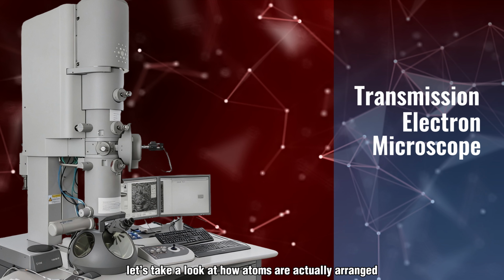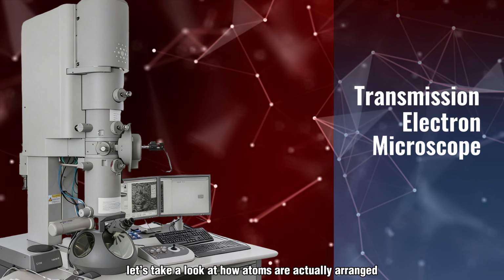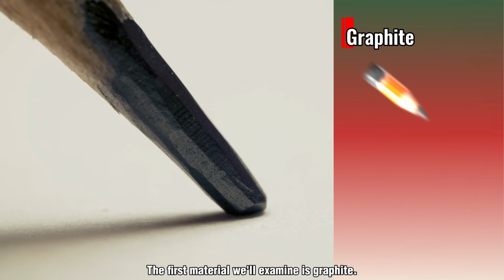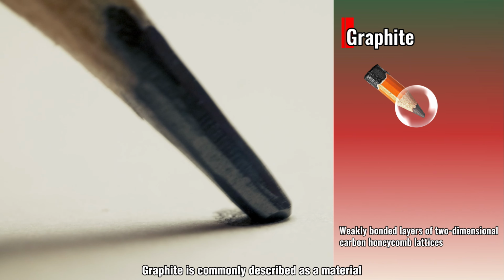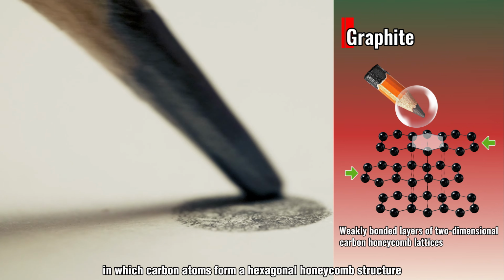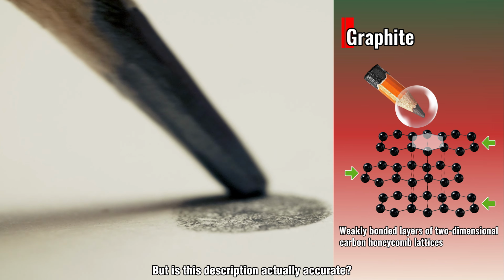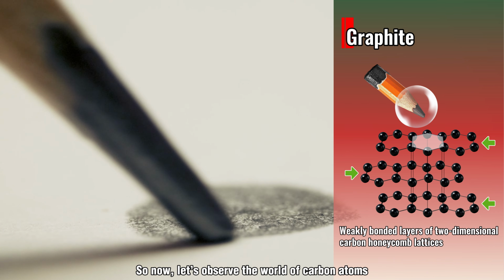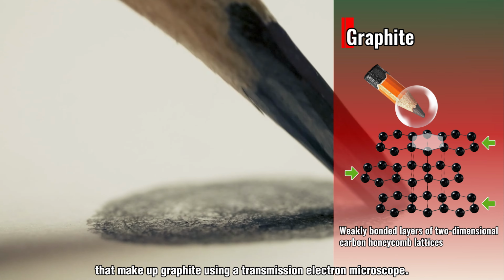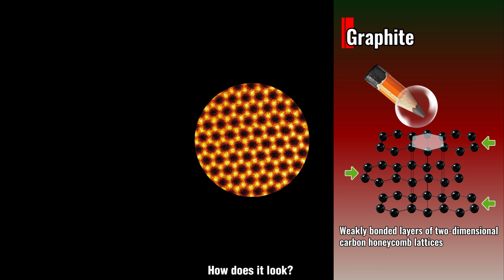So now, let's take a look at how atoms are actually arranged inside real materials using this electron microscope. The first material we'll examine is graphite. Graphite is commonly described as a material in which carbon atoms form a hexagonal honeycomb structure arranged in layers. But is this description actually accurate? So now let's observe the world of carbon atoms that make up graphite using a transmission electron microscope. How does it look?